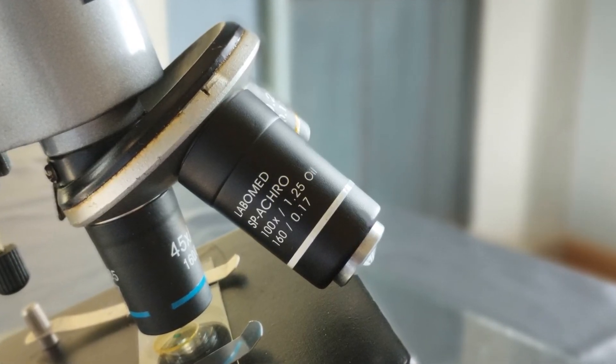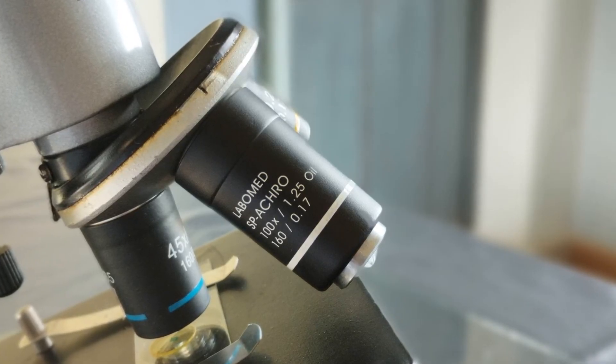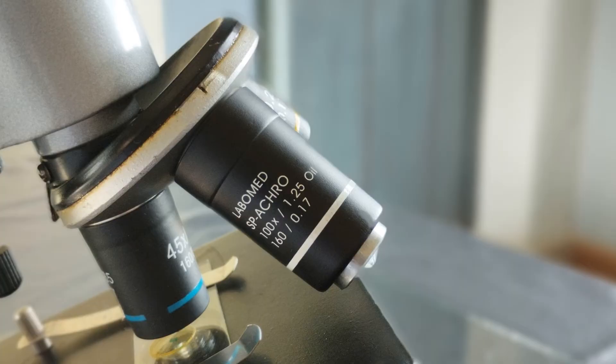One drawback of using the immersion lens, however, is that only dead specimens that have been permanently fixed on the slide can be observed with good clarity.